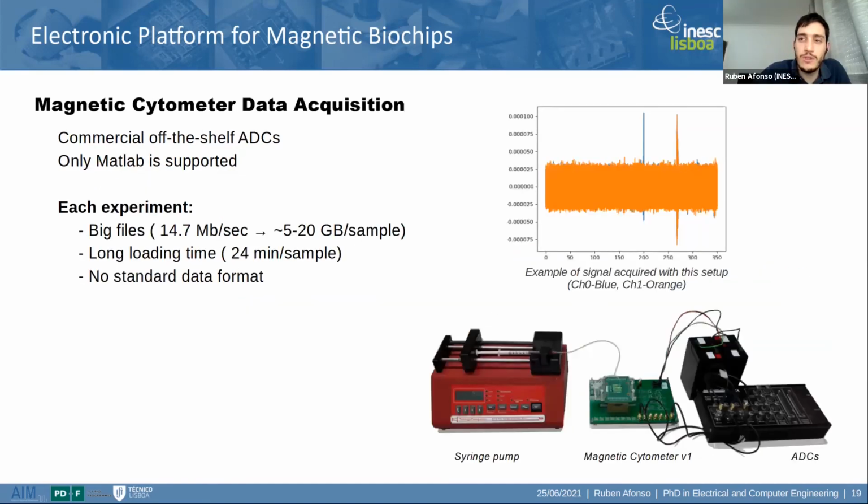Yes. We are using batteries. We need to use batteries to power the device, since they have low noise. Of course the system could be miniaturized into a box with everything, to be used in less developed countries or in the field without needing a power outlet.